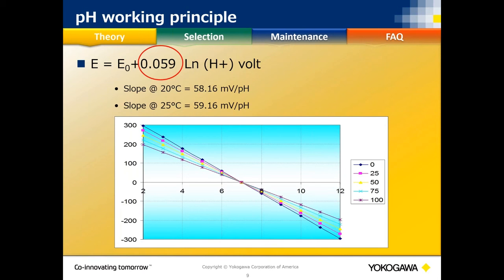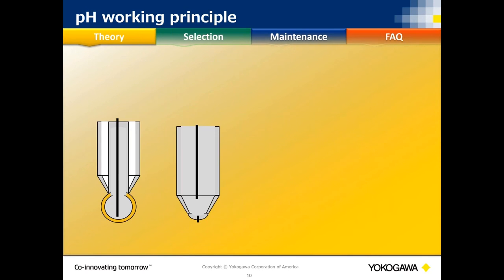So now let's look at a whole measuring circuit if you're interested in it. How does an actual pH electrode work? For ease here, we're going to keep the pH measuring and pH reference because there's 4 parts in a pH electrode itself. You have a measuring glass that's measuring the hydrogen ions. You have a reference that's creating a stable reference voltage for that potential that builds up on the sensor to be compared against. You have a temperature electrode because you have to have something to reference the temperature back to. And then you have a solution ground.